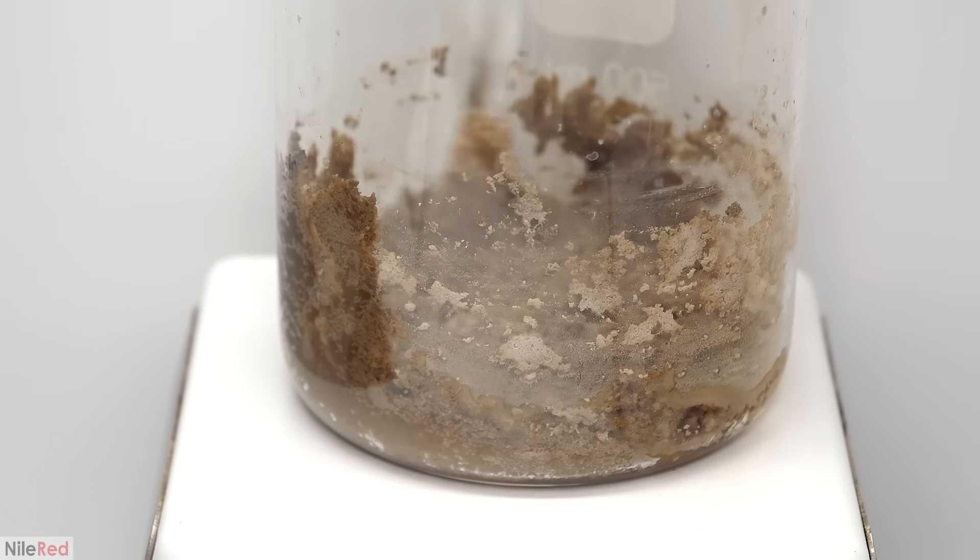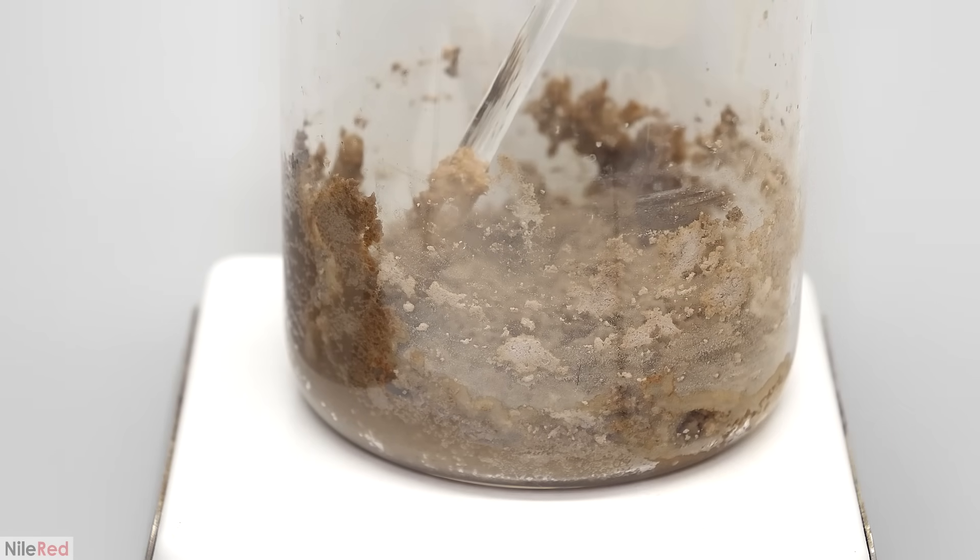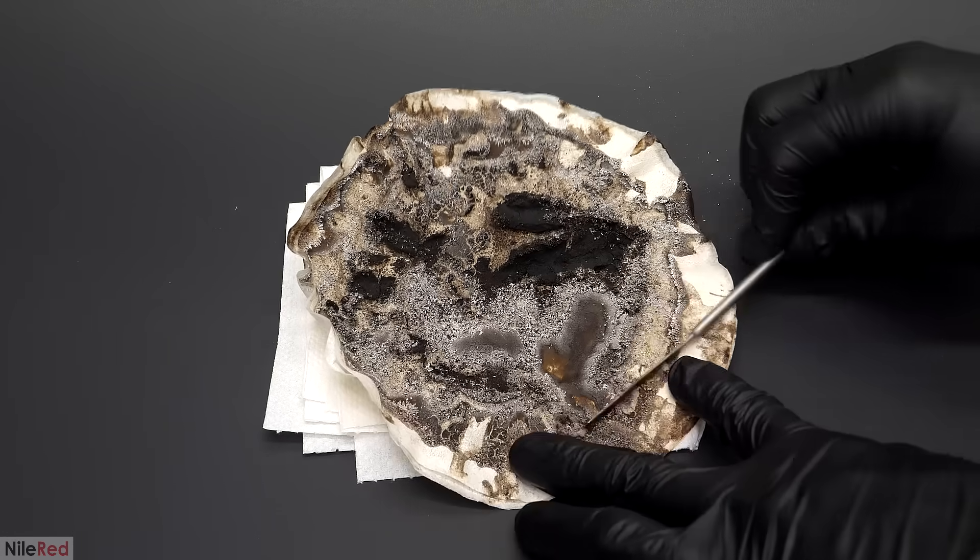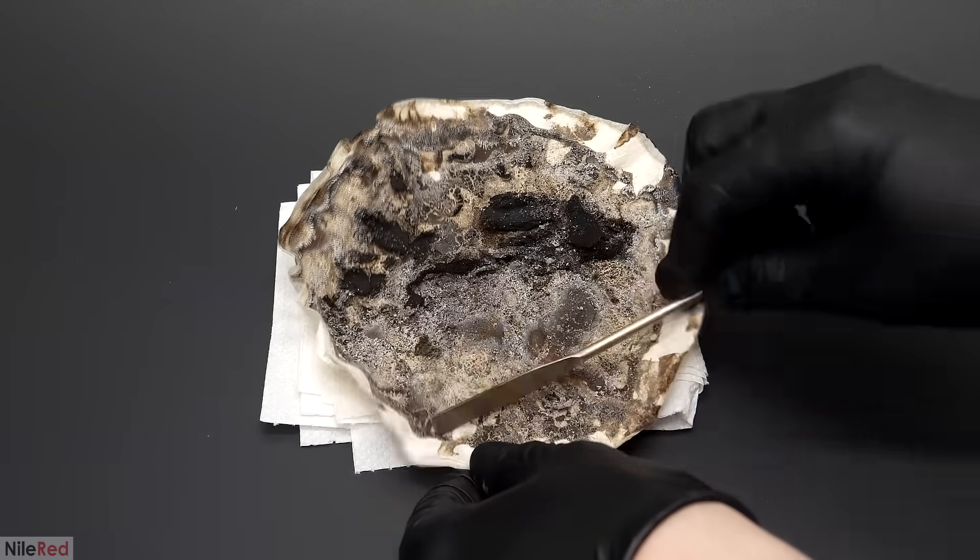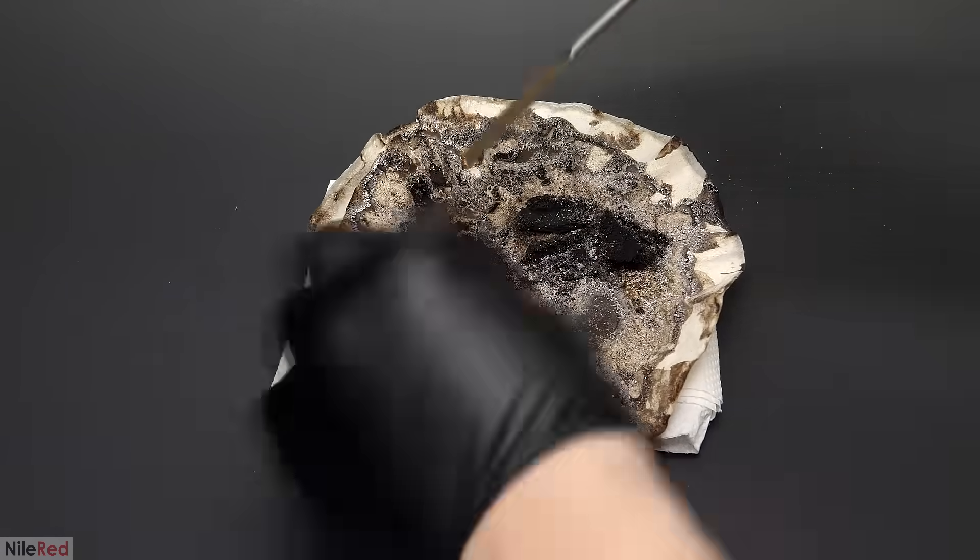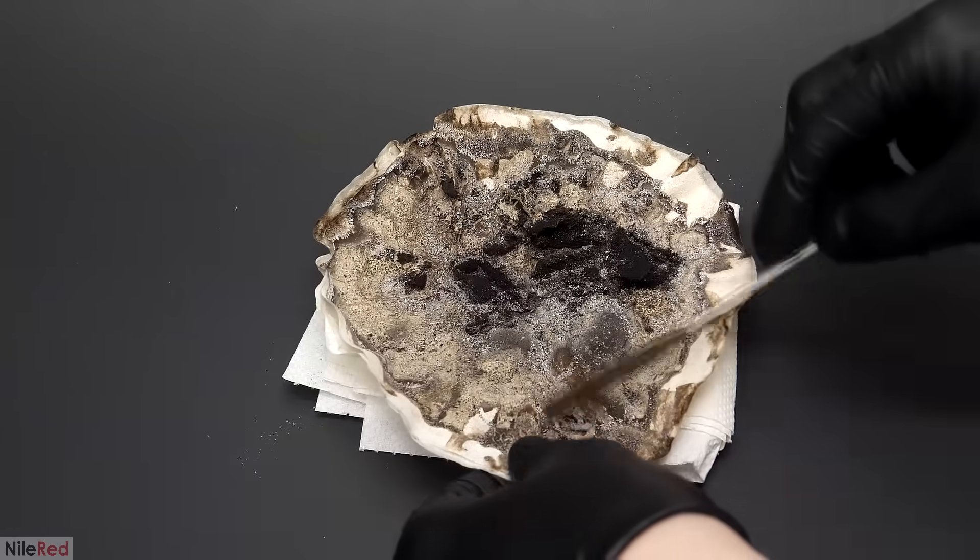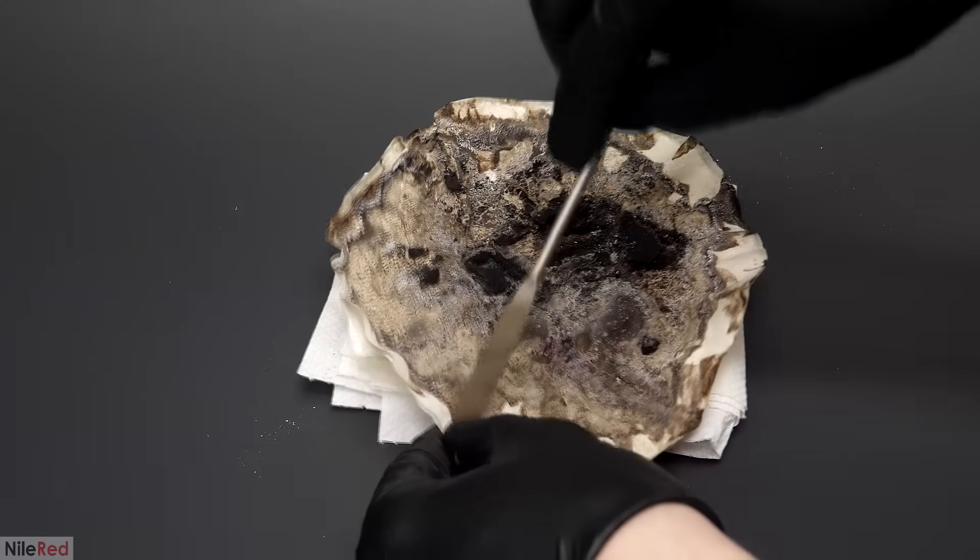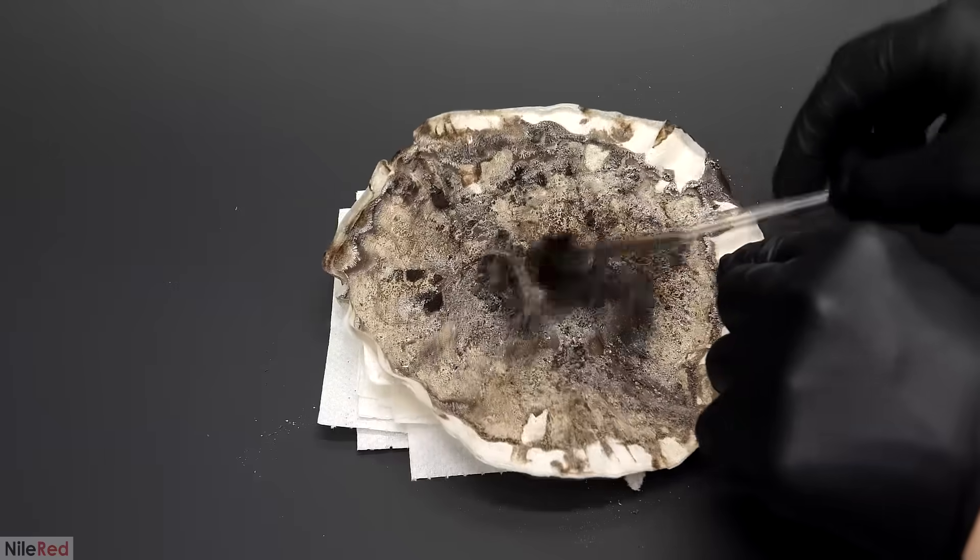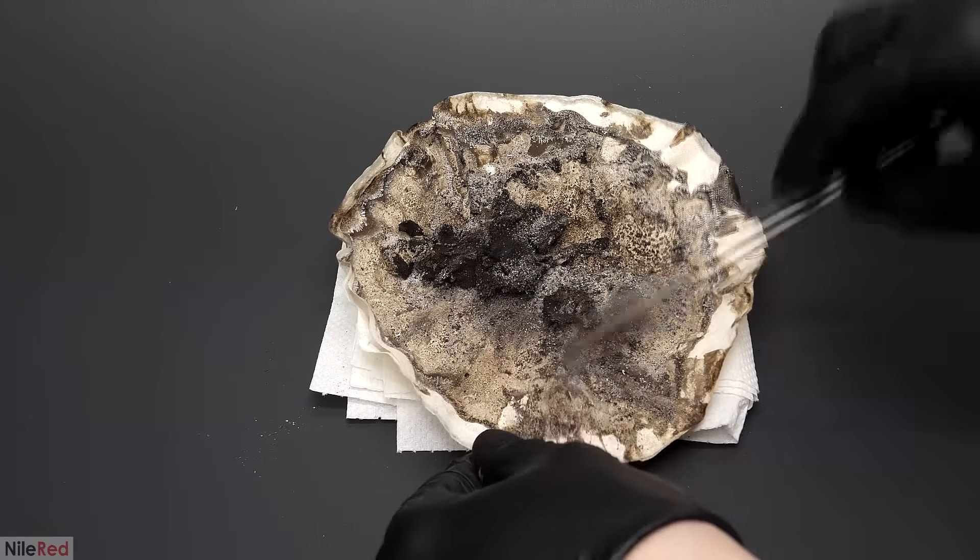When this was done, I took it off the hot plate and went back to check on my filter paper. Unfortunately, it was now a total mess, because I didn't bother trying to wash it with water, and it was now all crusted over with salts. Once it had dried, there also really wasn't much of it either, so it was pretty much just all junk now.